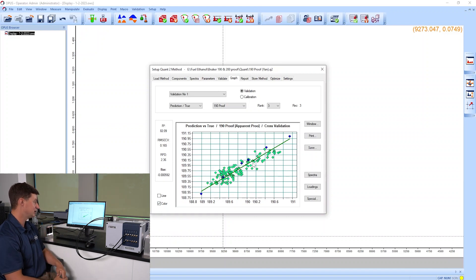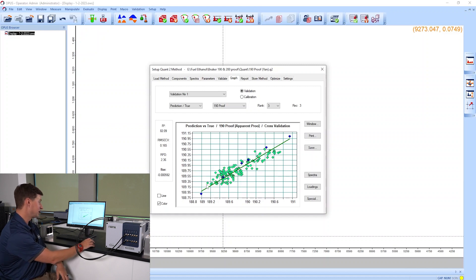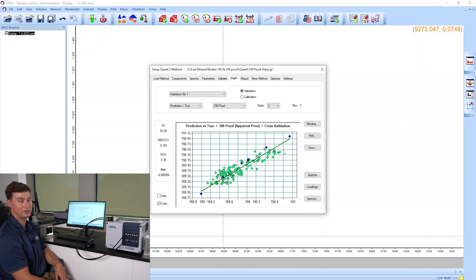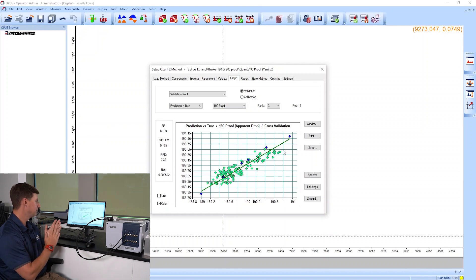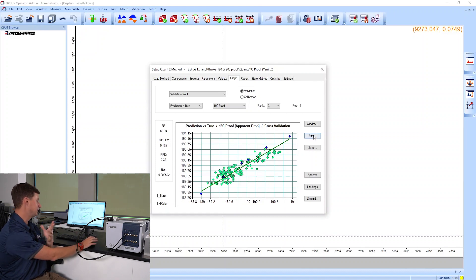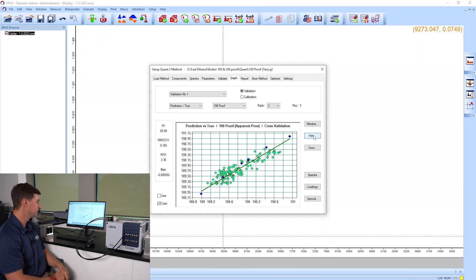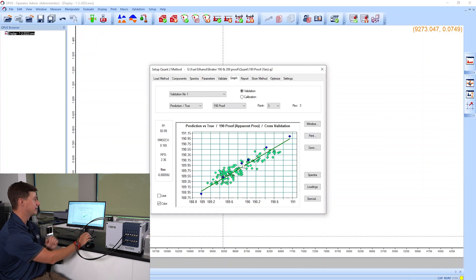This is a pretty tight range of a calibration. The original calibration goes from roughly a little over 189 proof to roughly 190.6 proof, so the range on the calibration is very small. We've actually extended that by roughly half a point with these additional spectra in here. You can see it spans the range and it's pretty close.